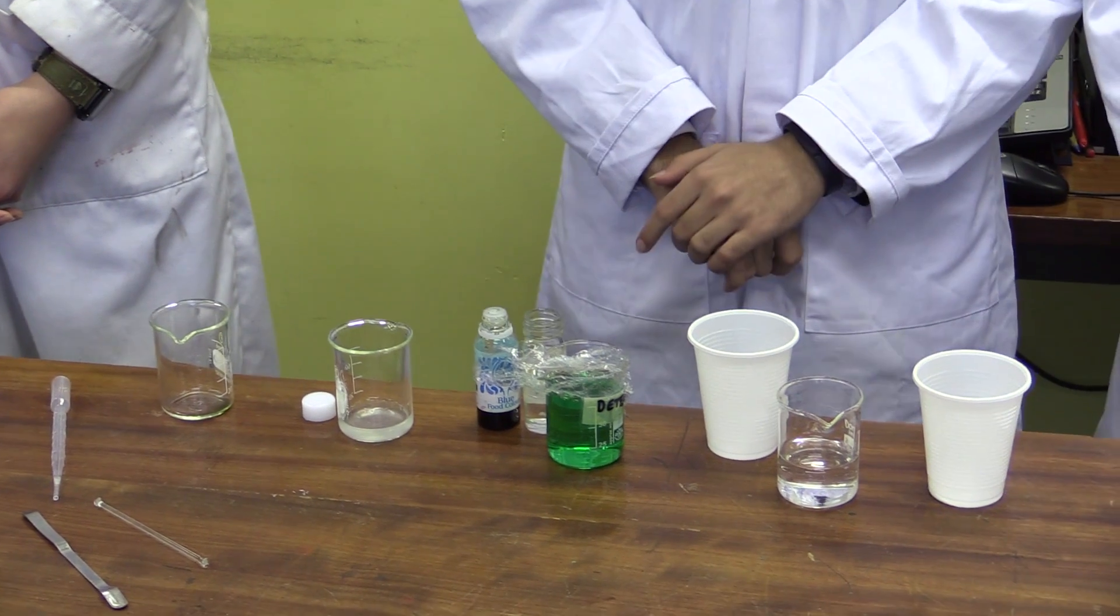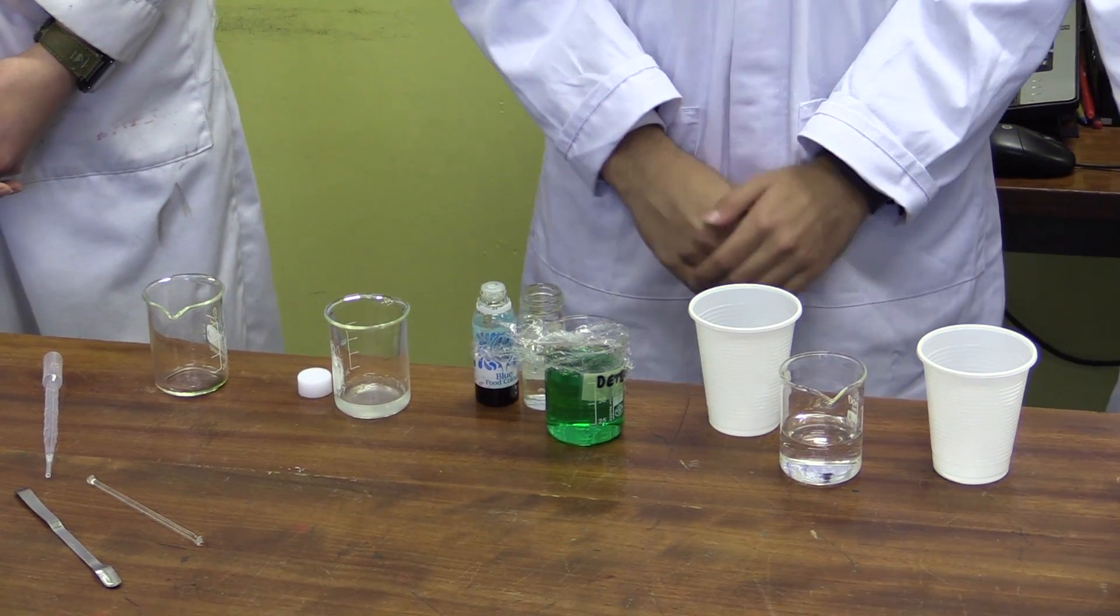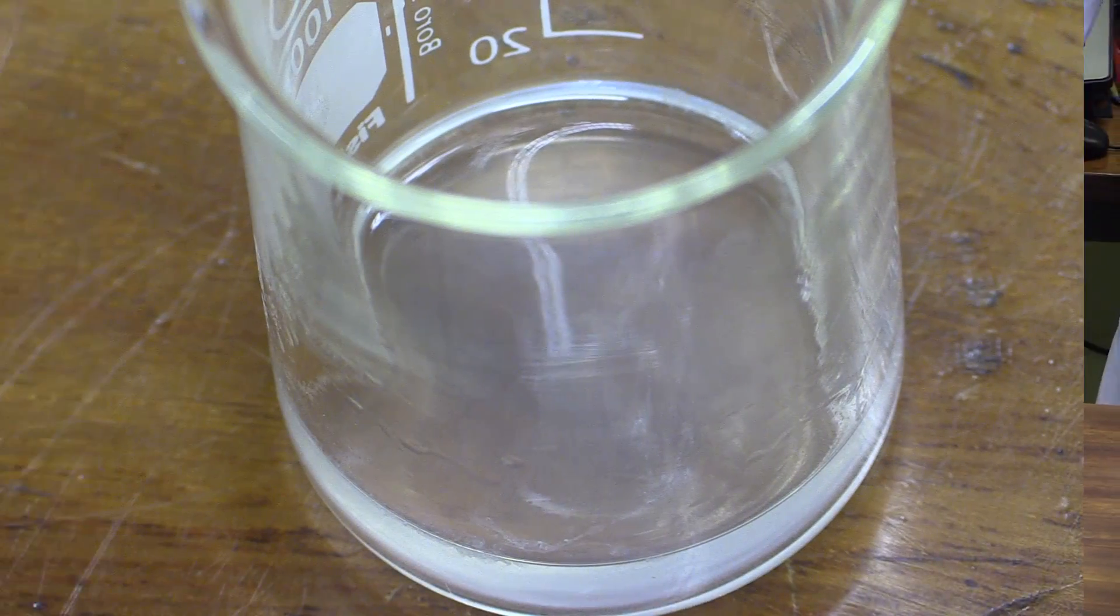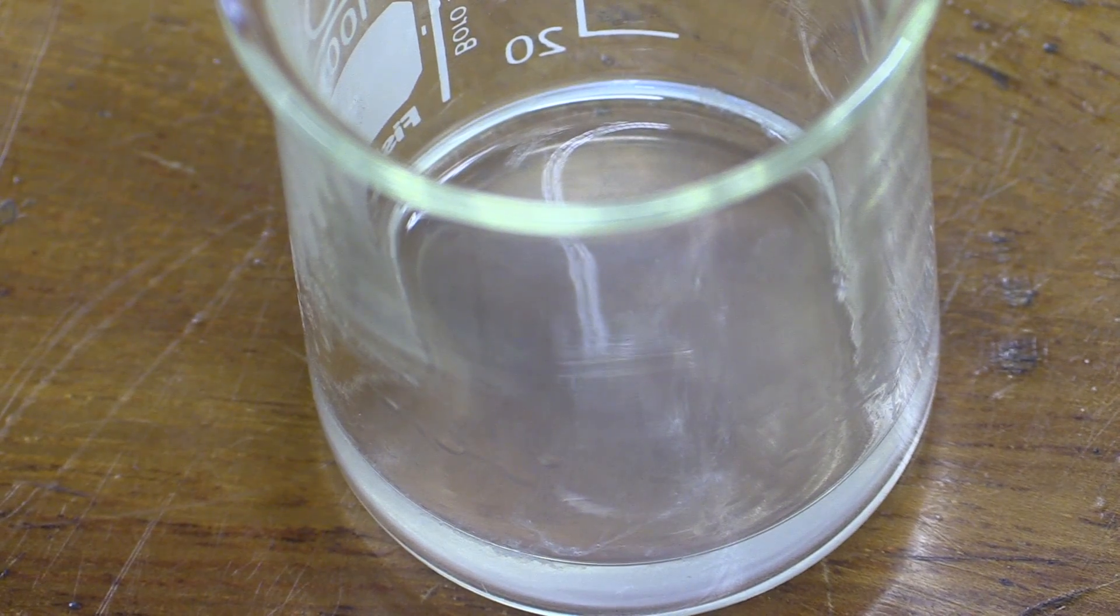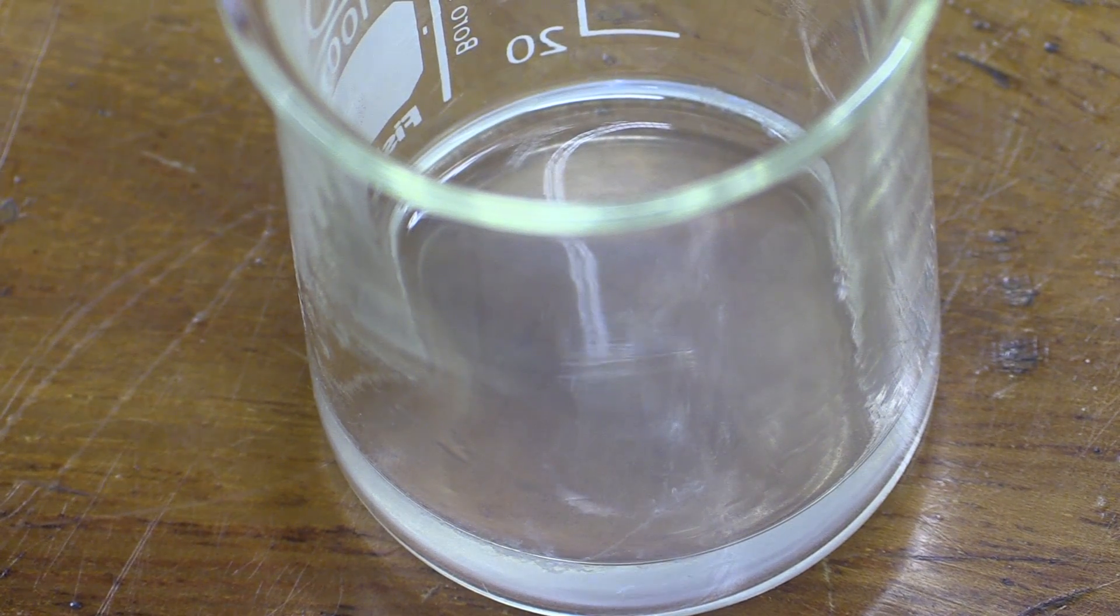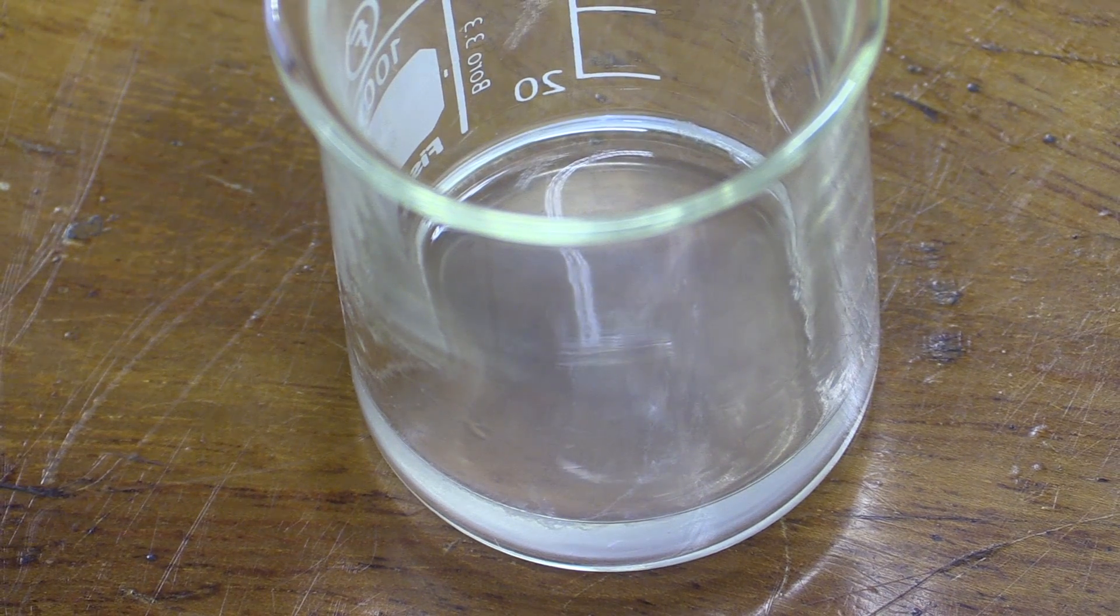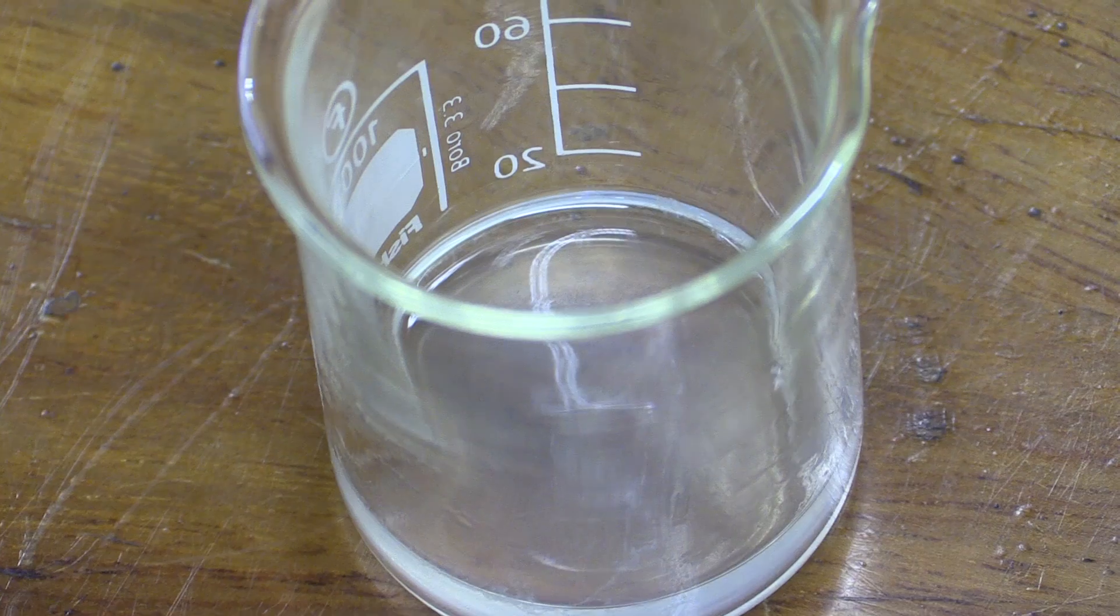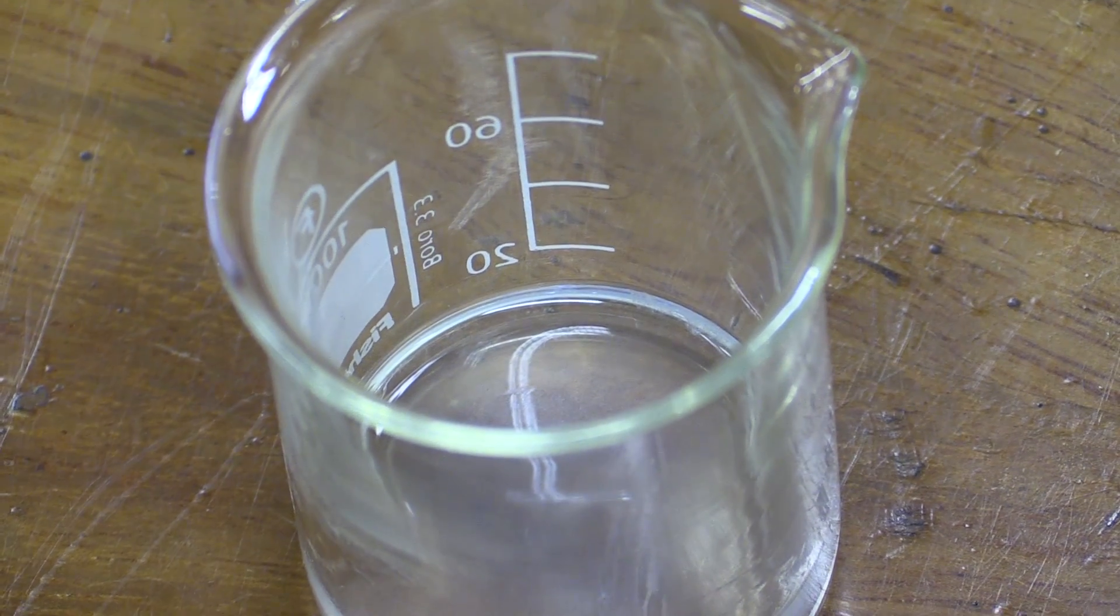After two to three minutes, we should see clumps of DNA forming at the top of the liquid. Now, after two to three minutes, you will probably see these clumps, or these strands, on the top of the surface of the liquid. These are made up of thousands of DNA molecules.